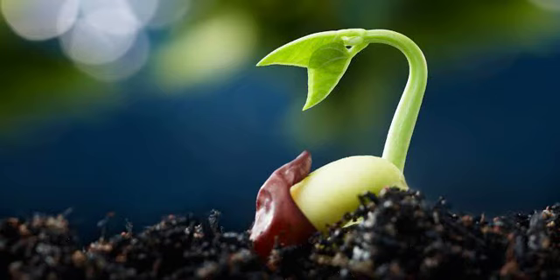The warm germination test reflects the field emergence potential of a seed lot under ideal planting conditions. A minimum of 400 seeds are required to be tested in 4 replications of 100 seeds each, or 8 replications of 50 seeds each, or 16 replications of 25 seeds each.